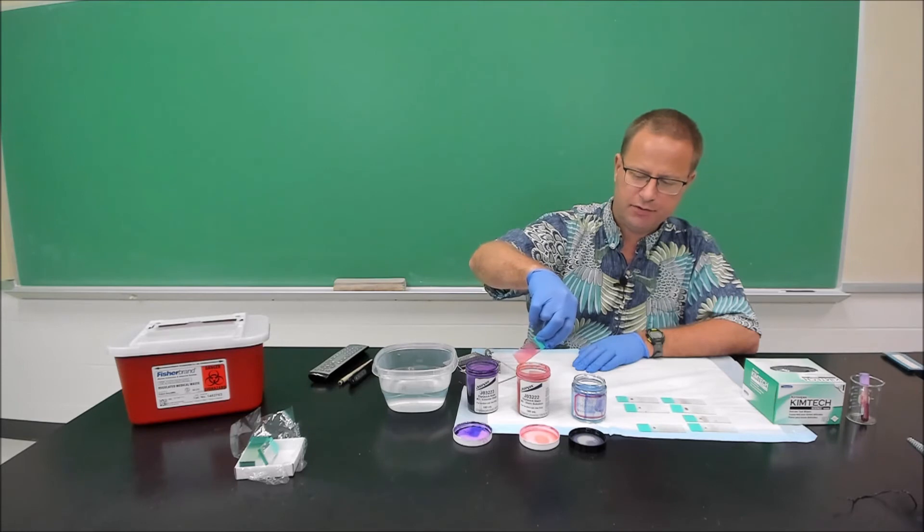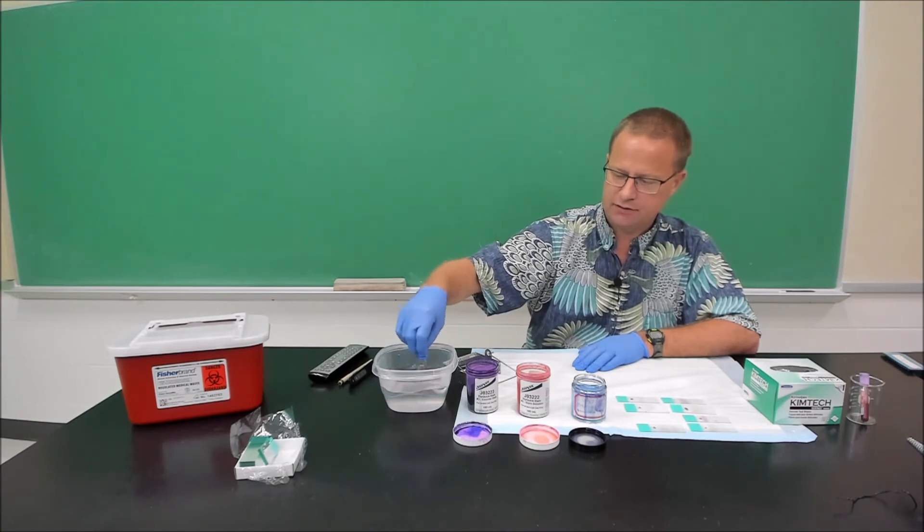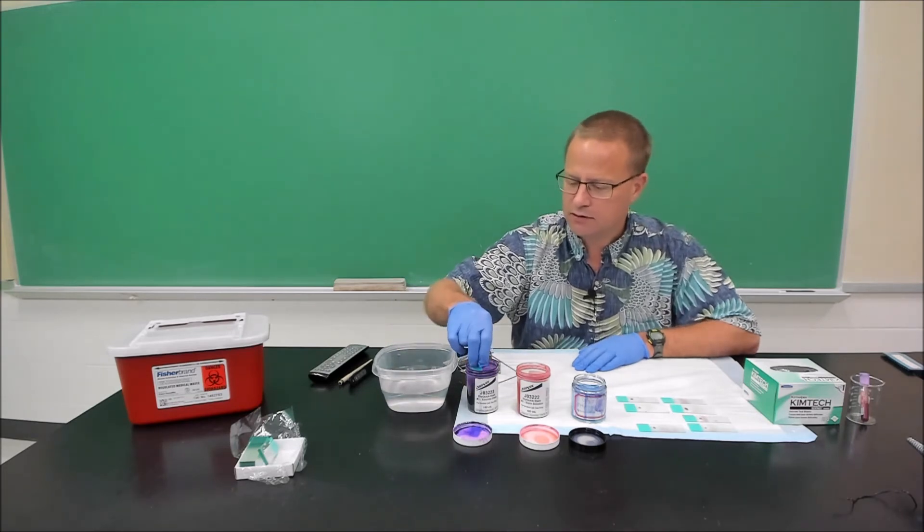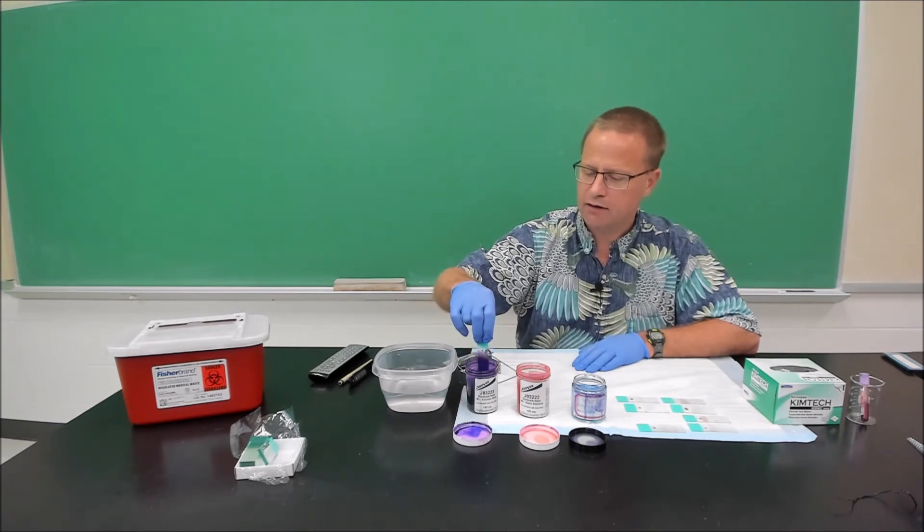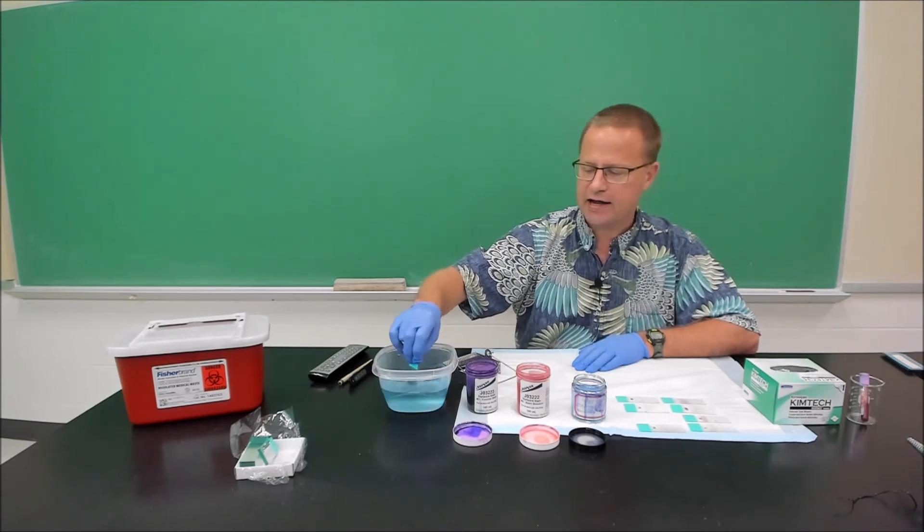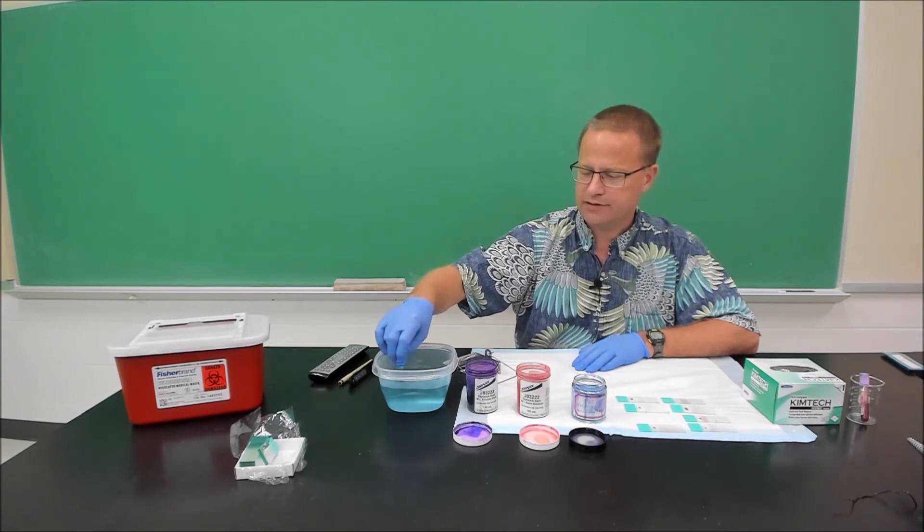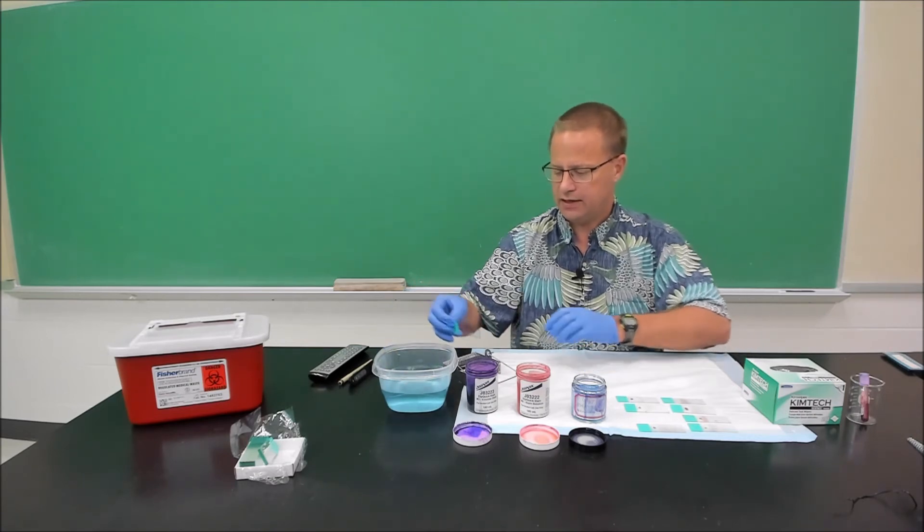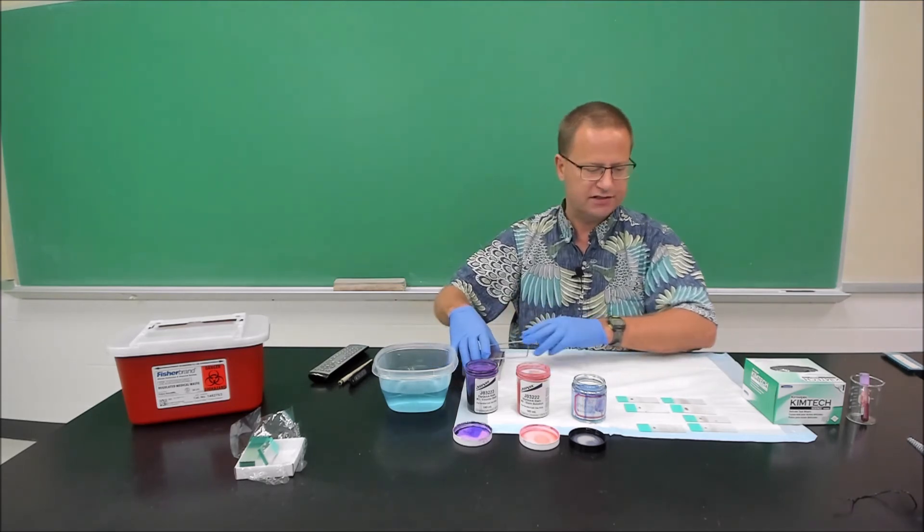Now some people have you rinse in between this one and the next one, so that's not my stain, so I'm going to go ahead and do that. And then ten in here. And then final rinse and water. And normally we would do this under tap water, but we don't have a readily available sink real close, so we're going to do this right here. So that's fine. And I will put this in that one. So we'll be able to rinse them off again in a minute.